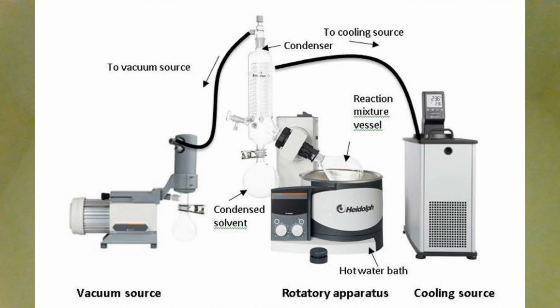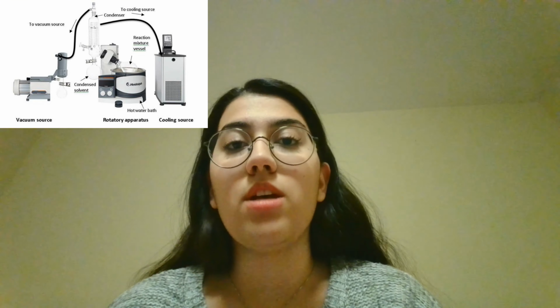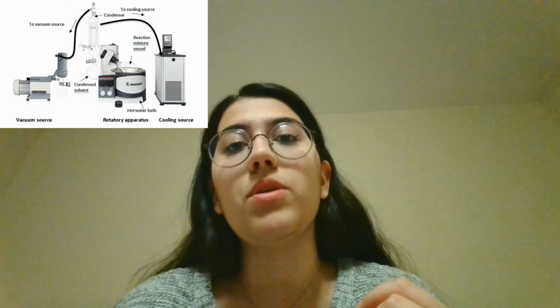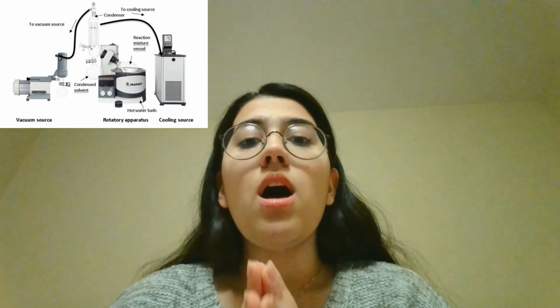In order to do so, we need to pour our solution into a round bottom flask and attach it to a bump flask on the rotary evaporator and secure it with Keck clips. The bump flask traps the solution that bumps and does not allow it to enter our rotary unit. The flask will constantly be rotated and heated in order to remove the solvent and have the solid isolated.